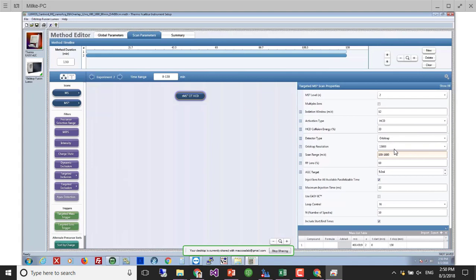We've got the Orbitrap. Here I've got the Orbitrap running slightly faster because on the Fusion Lumos, the source is a little bit brighter, and so we can deal with fewer ions typically, or we can deal with less time to inject ions because we get more overall.